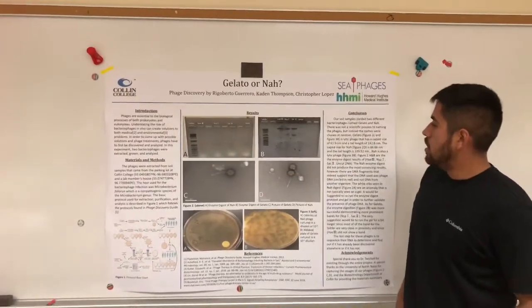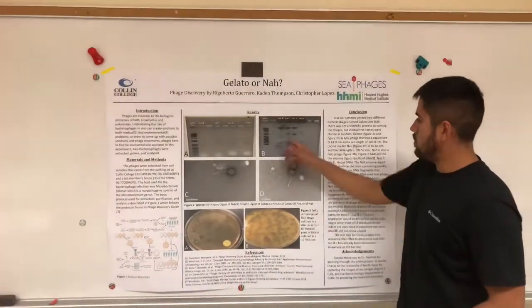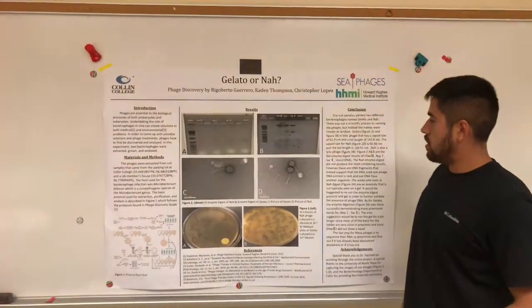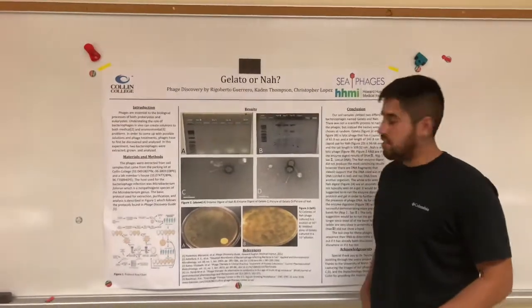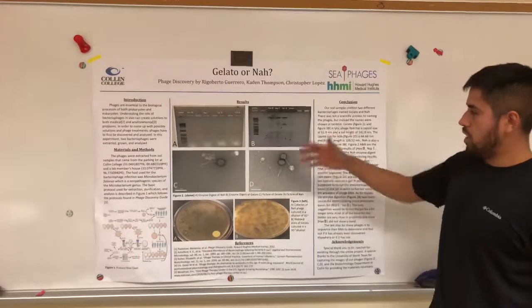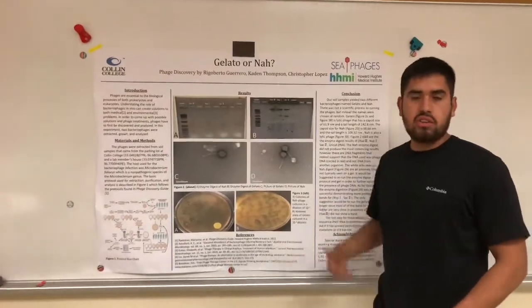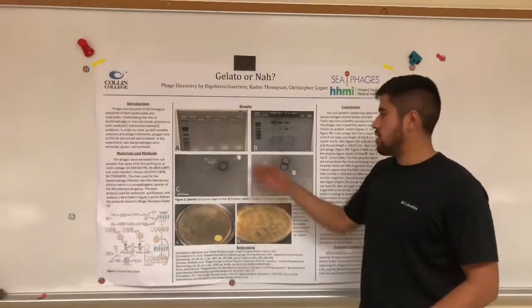As you can see, the enzymes NSP and SAC2 had way better results with darker bands at different positions, showing us that it did digest the DNA and that there was a lot of DNA present in order for the enzymes to work and digest the DNA. So overall, I'd say we were able to run the enzyme restrictions. However, I would just suggest rerunning Nah, just to further clarify and to solidify that we did have adequate DNA.